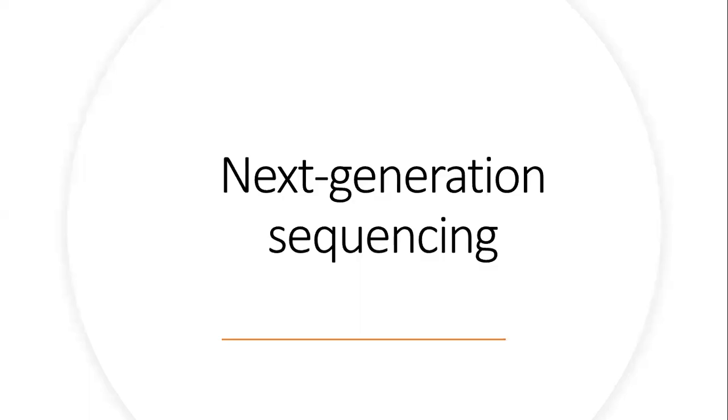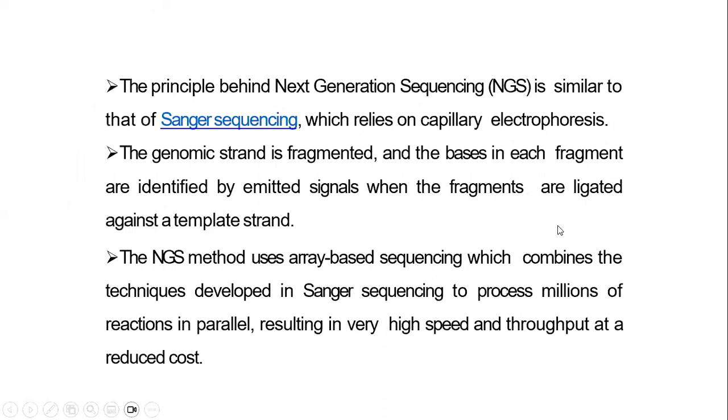Hello students, in today's class we are going to learn about next generation sequencing reaction. The principle behind next generation sequencing is similar to that of the Sanger sequencing, which relies on capillary electrophoresis.